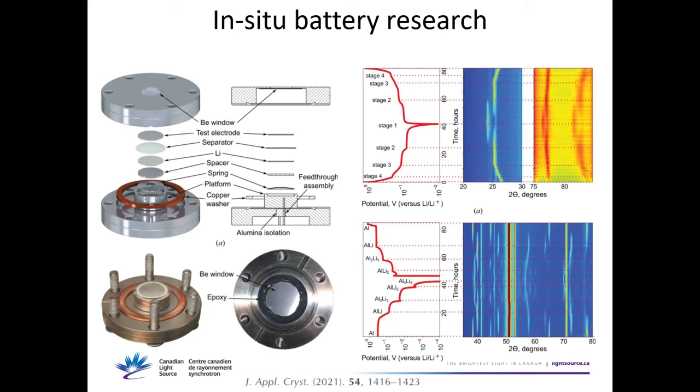And here's an example of results that he can get with that battery setup. And you can see while the voltage is cycled, you can see all the phases that show on and off, the different lithium aluminum phases while the battery cycle proceeds.